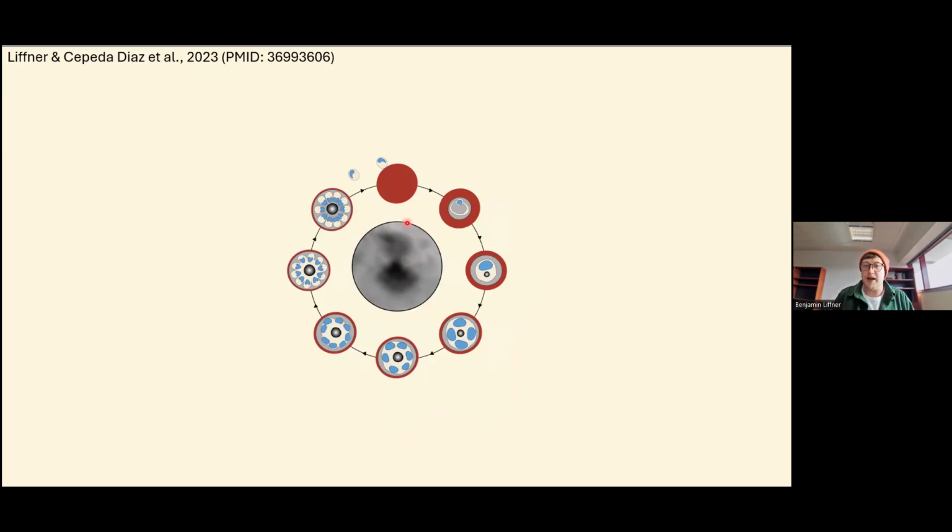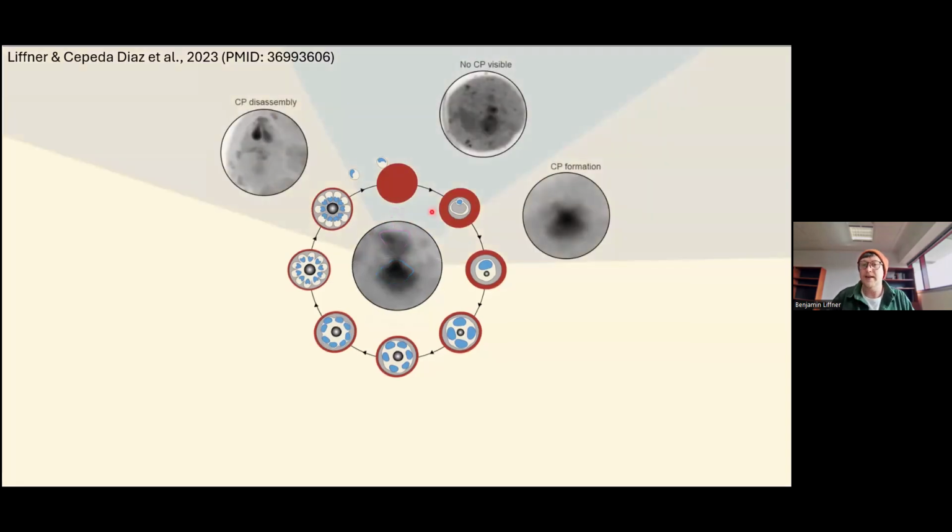The centriolar plaque spans the nuclear envelope, which is roughly indicated in white. It has an inner region inside the nucleus that makes the microtubules needed for mitosis, and then an outer region that anchors the nucleus to the parasite plasma membrane here in magenta. We tracked centriolar plaque dynamics from its biogenesis up until its disassembly right at the end of zoite formation. An interesting implication was that the formation of the outer part of the centriolar plaque seemed to be the first establishment of polarity within the cell. This was really important for some thinking afterwards.